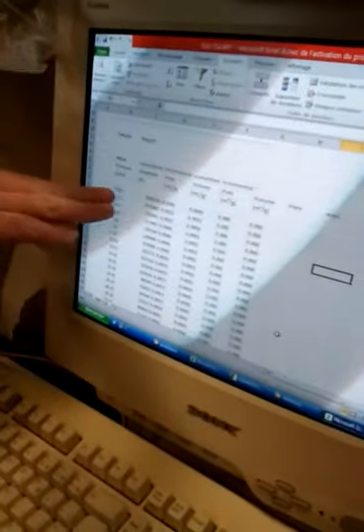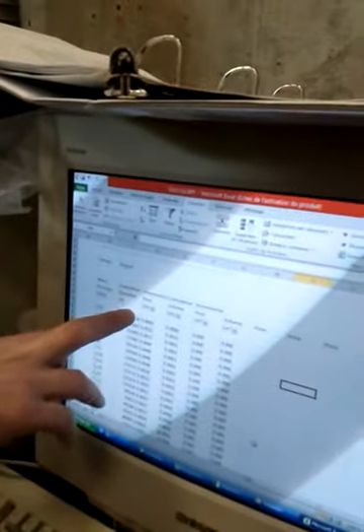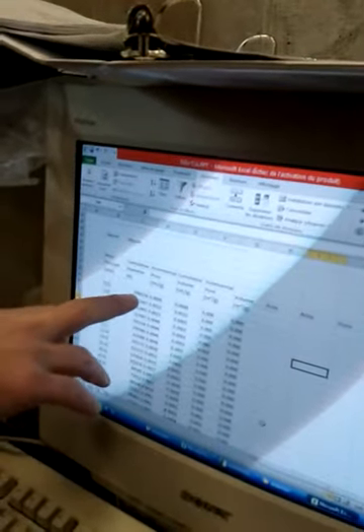What we got here, in fact, is for all pressure steps. It contains the diameter of the pore. Okay. Because it's a kind of model, let's say, to fill a pore of this size with mercury, you have to increase the pressure, to have a difference of pressure, and this pressure will fill a pore of this size.